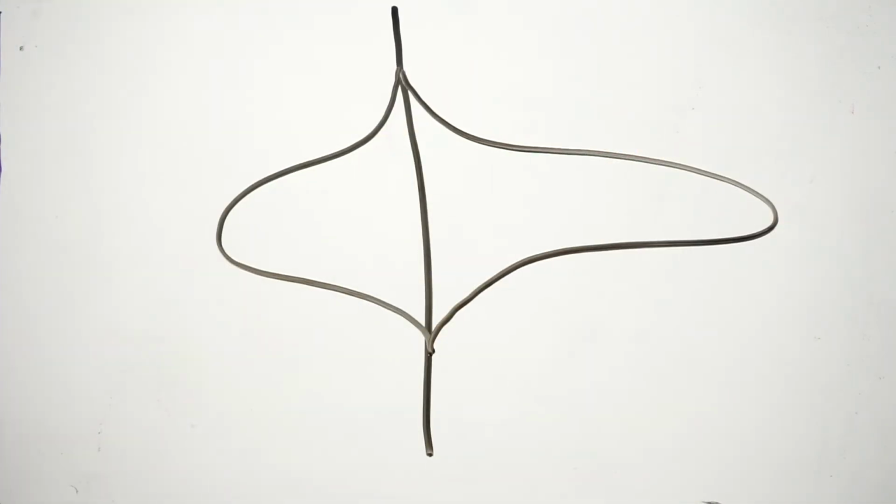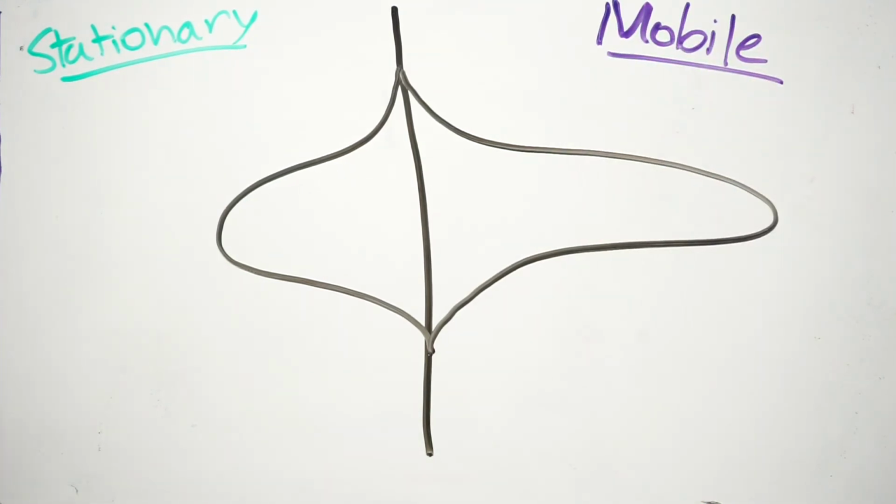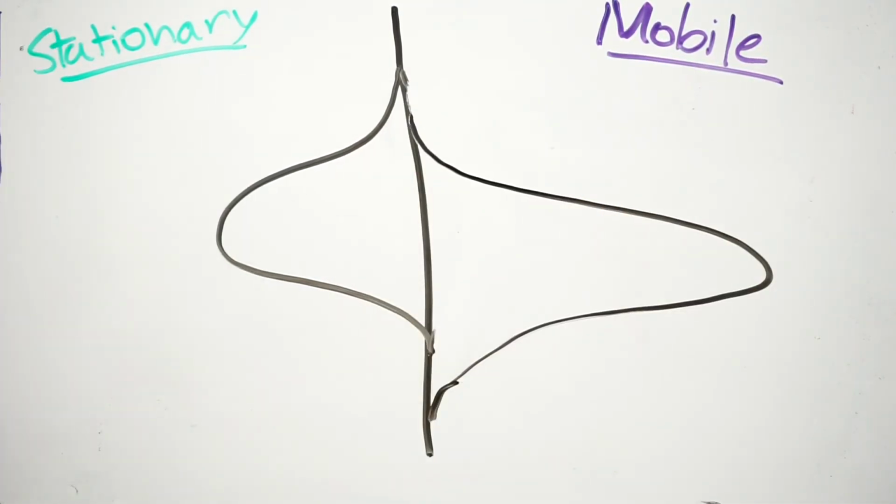The analyte particles in the column act in the same way. You can imagine this grouping of analyte in the mobile phase as the sliding door, and as it moves further down the column, it allows some of the analyte that was previously covered in the stationary phase to begin to diffuse out and join together with the clump of analyte that had previously kept it in solution. Then, the reverse process happens on the other side of the analyte band, where some of the analyte in the mobile phase will push into the stationary phase to maintain the dynamic partitioning equilibrium.